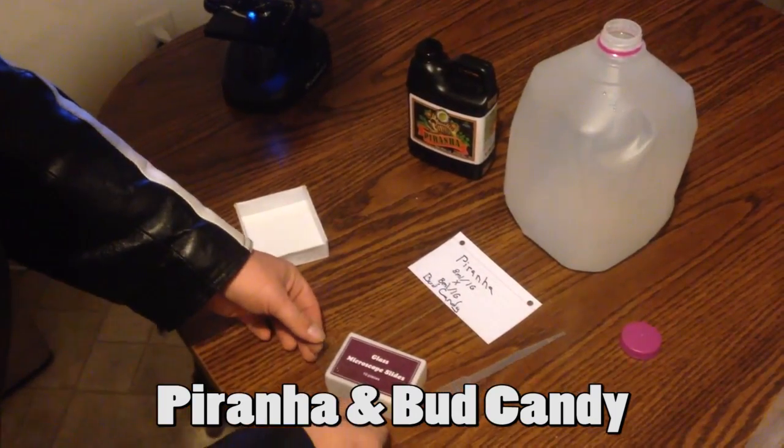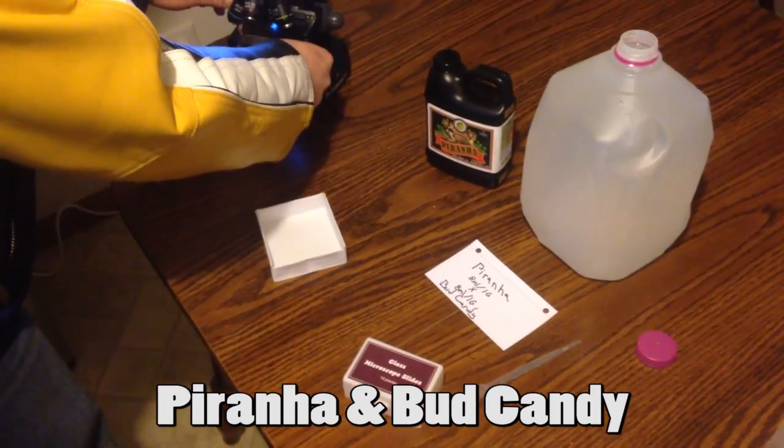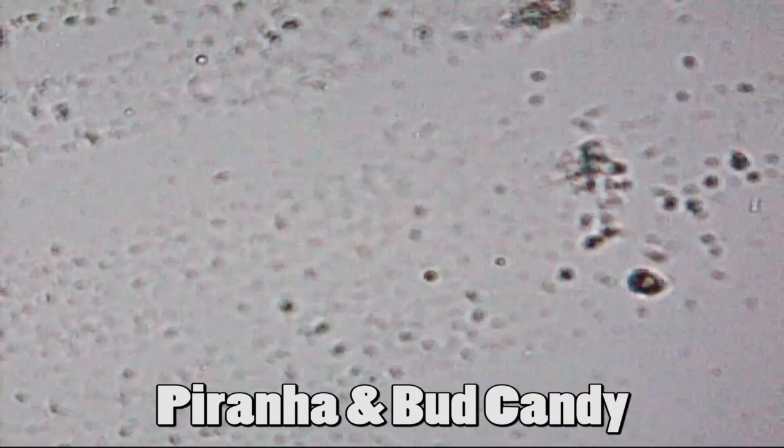First we have Advanced Nutrients Piranha and Bud Candy, 8 milliliters each. A closer look under the microscope shows us a number of material and some activity.